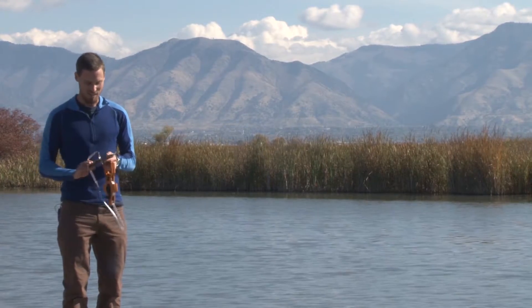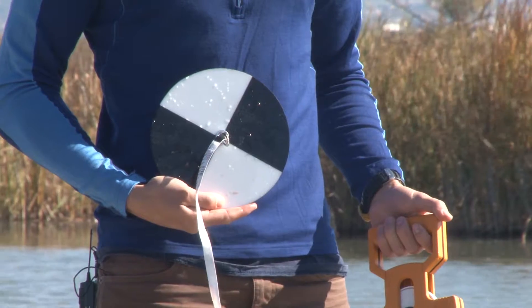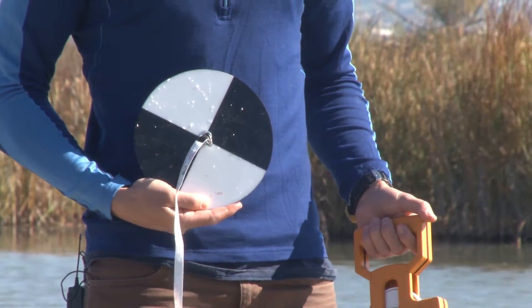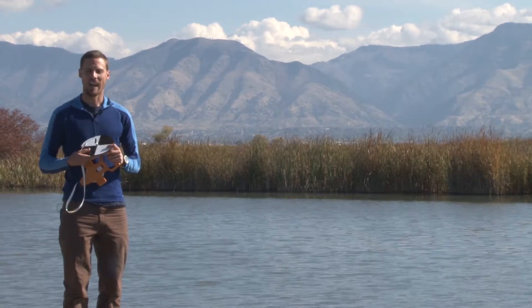The Secchi disk is one of our oldest and most important measurements for lakes. It's a white and black disk that's eight inches in diameter that you lower into the water to see how clear it is.